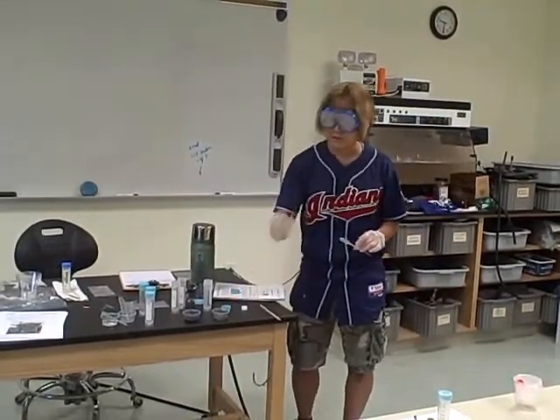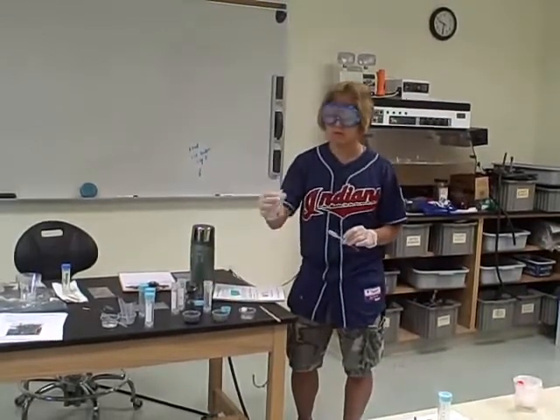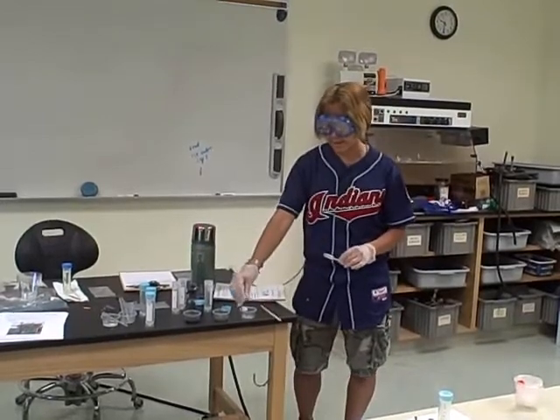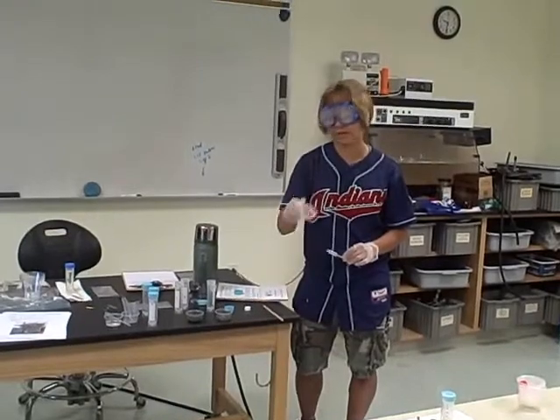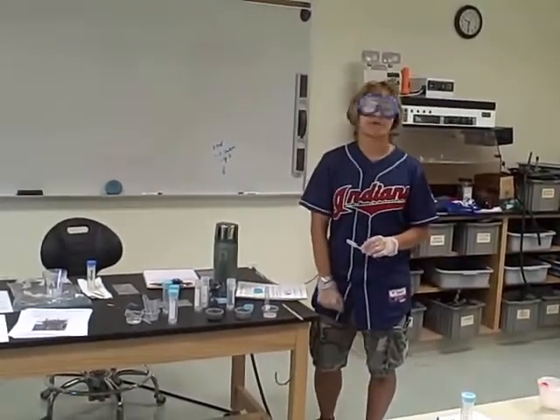You are given this additional cup that's labeled 13. If you would like, you can transfer this rather than doing what I did, which is leaving it in the container. If you're more comfortable transferring it to this and then doing the drop ring, you're welcome to do that.